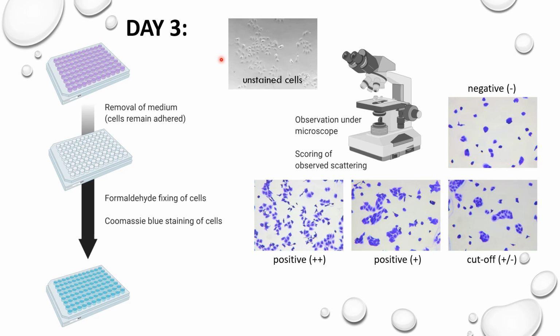You might see that the cells look rather stressed or the medium has changed color because the bacteria have acidified the medium. Both the secretion of toxins and the change of pH really affects the cells, and you might get some very strange results in an assay from a contamination. So it's something you have to pay attention to. However, the cells I think look really nice.